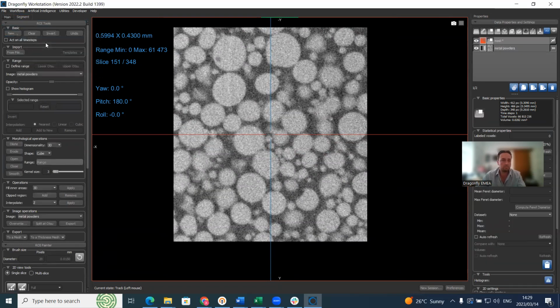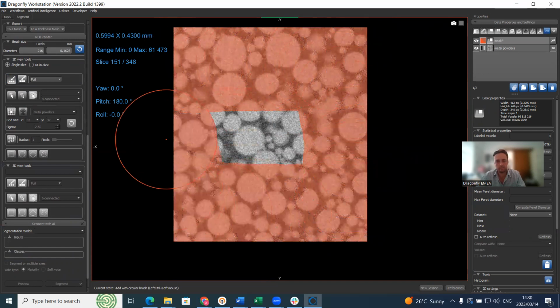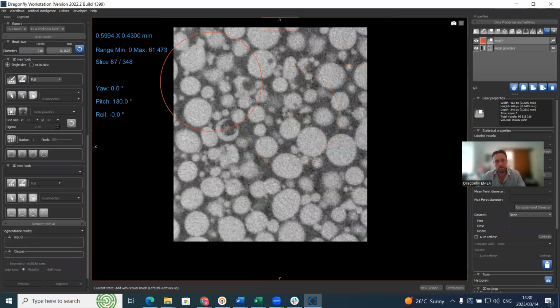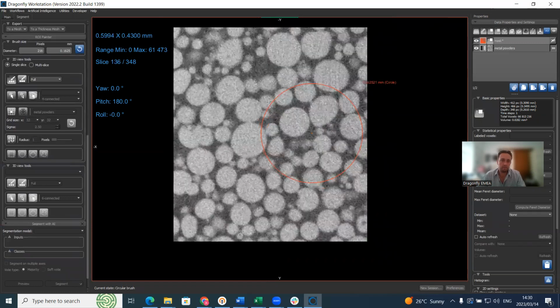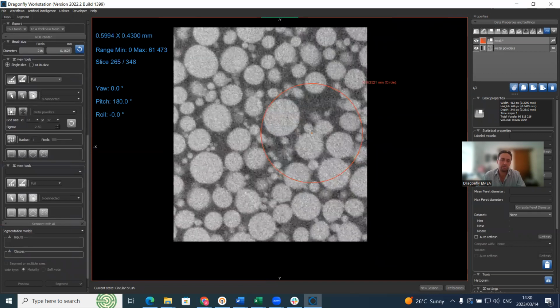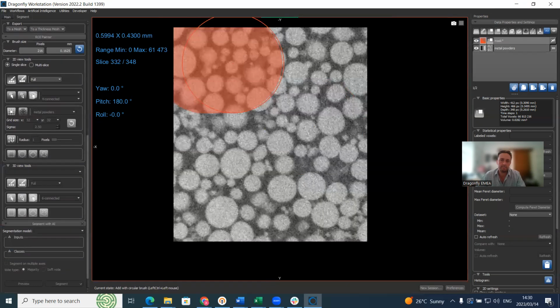Let's call it mask. I've created an ROI with the segment new ROI basic tool. So it's an empty ROI at the moment. And then we take this full slice, single slice brush, and we take this particular slice, and let's see for another slice in the data, and let's take a third slice, covering sort of the different types of images in the data, so you can go near the end.